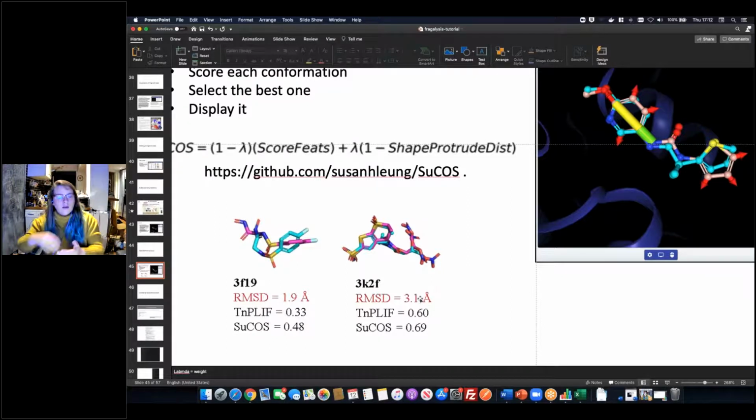So you can get quite high RMSD values based on small deviations in small bits of the molecule. But when you compare that to a visual overlay, so if you actually looked at it physically instead of just relying on an RMSD value, what you'll see is quite different to what the numbers will tell you in a lot of cases.